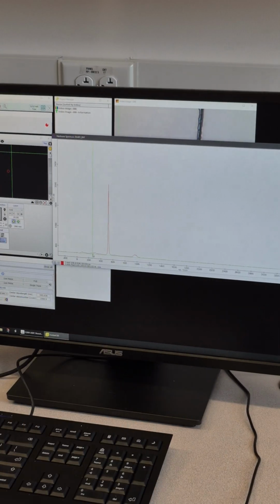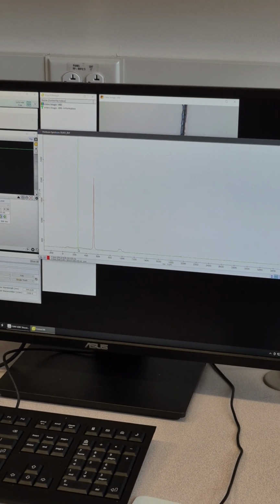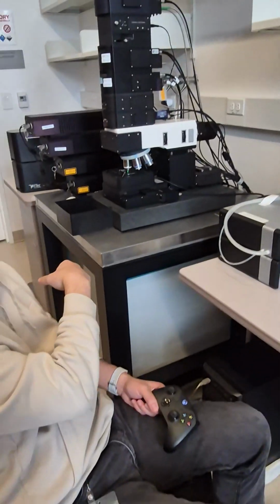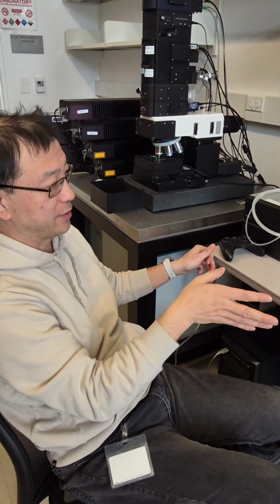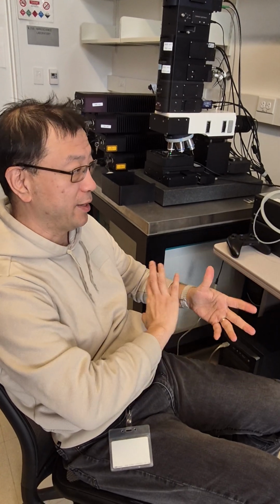And also remember, because the laser might drift by itself, the alignment might be off. Especially the 532 laser drifts, and it does not drift at a constant speed. Sometimes after 3 days it's still really good, sometimes after only 1 day it may drift off.